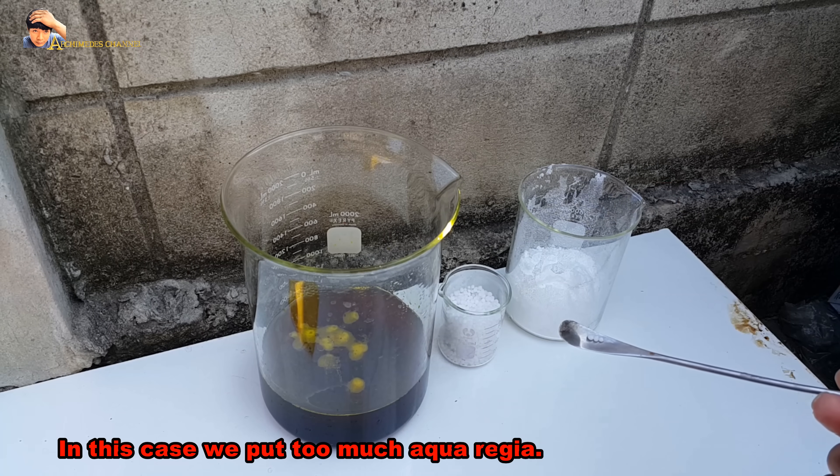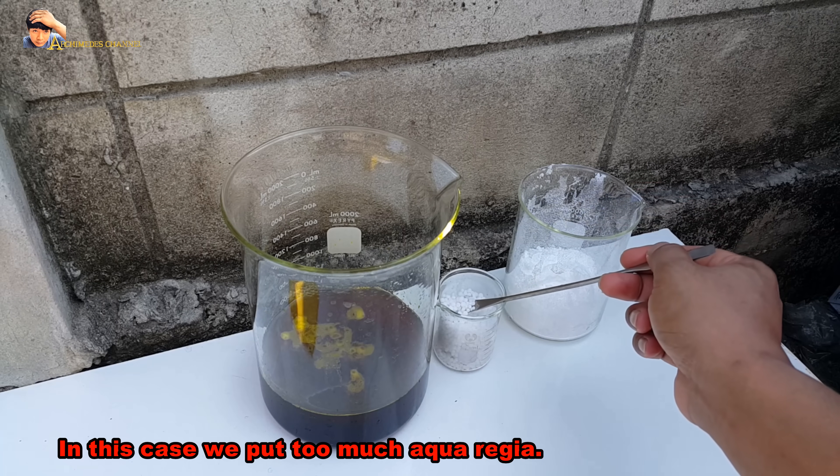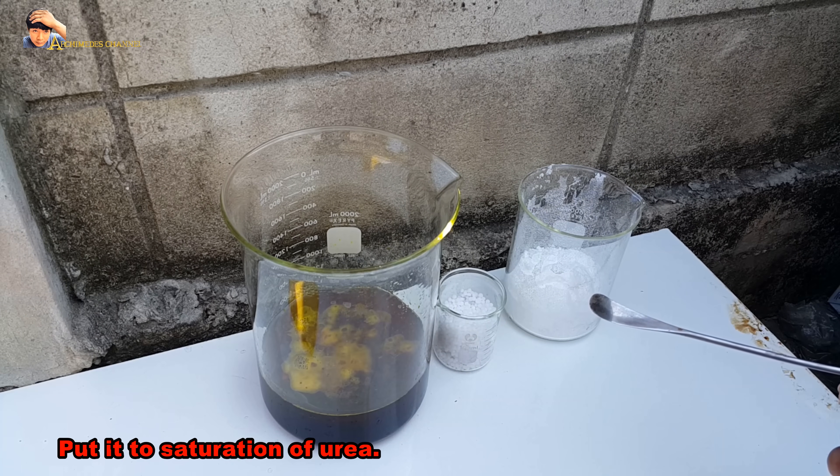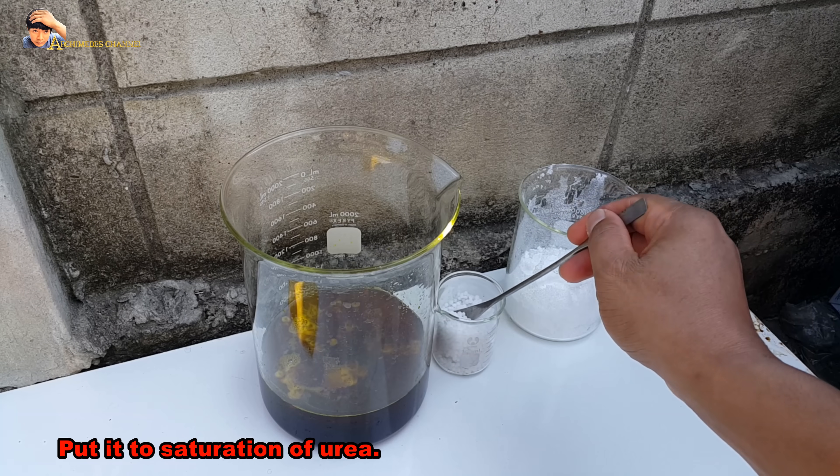In this case, we put too much aqua regia, so we have to use urea to reduce the acid in the aqua regia. Put it in to the saturation point of urea.